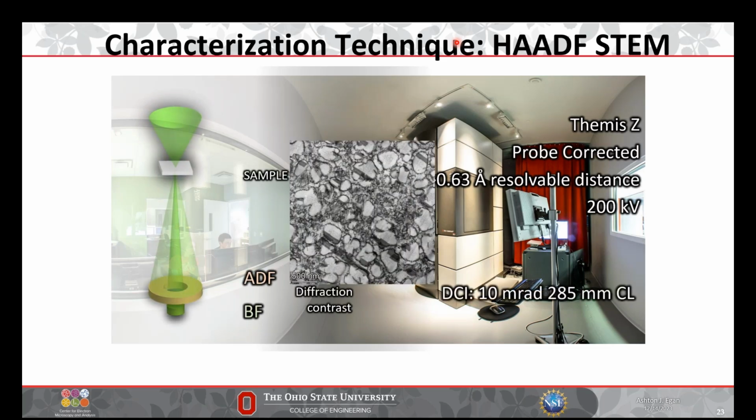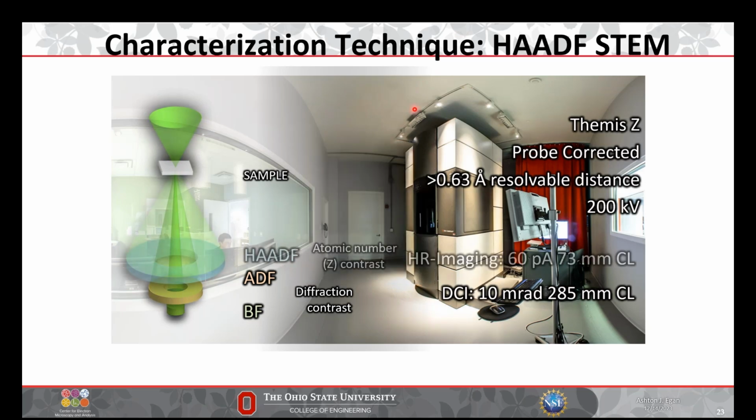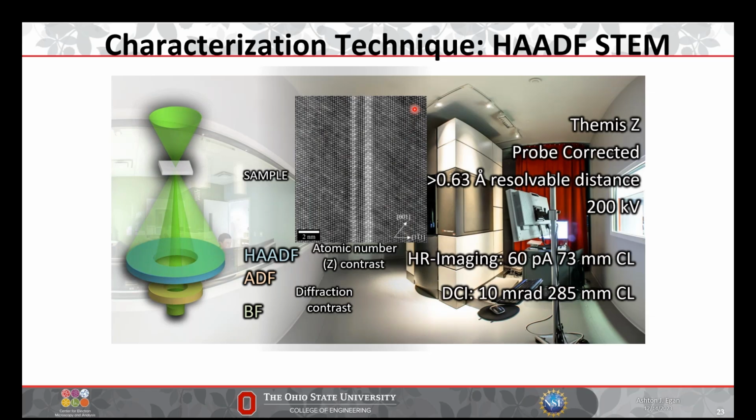And so then once we have one of these foils, we can do several things. We can use bright field and annular dark field detectors to take diffraction contrast images and correlate this with the ECCI images that we saw and go, okay, we see the same distribution of defects, these same traces, and for instance, these inclined things are stacking faults. And then we can do what I was talking about earlier, which is looking directly down the 110 type zone axis.